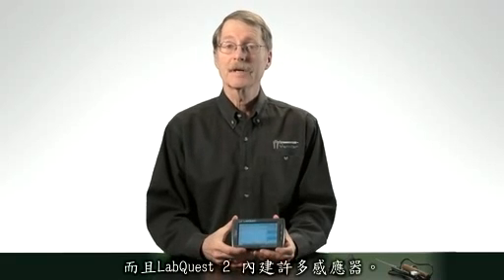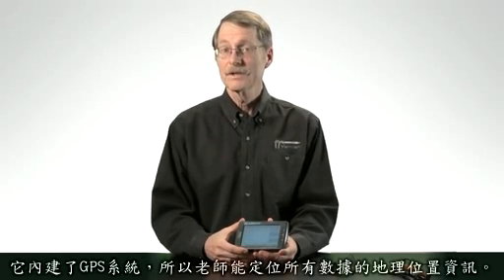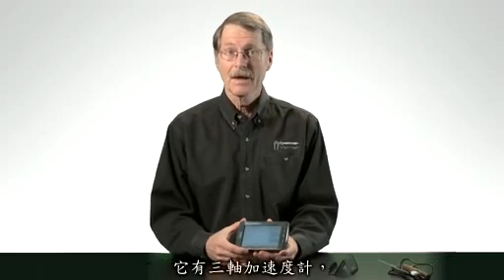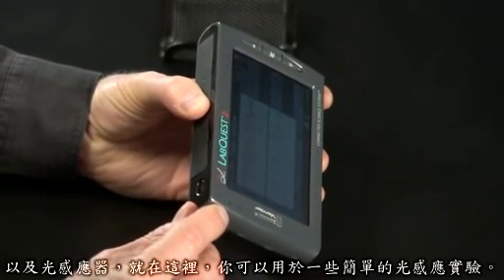The LabQuest 2 comes with built-in sensors. It has the two sensors that the original LabQuest had — temperature and microphone — but the things we think teachers will be most excited about are the new sensors. It has a built-in GPS system so teachers outside can geotag their data. It has a three-axis accelerometer, and it has a light sensor that you can use for simple light experiments.